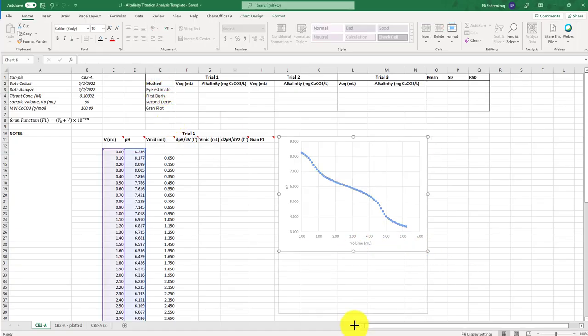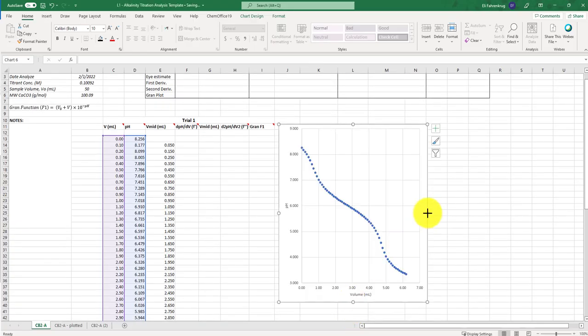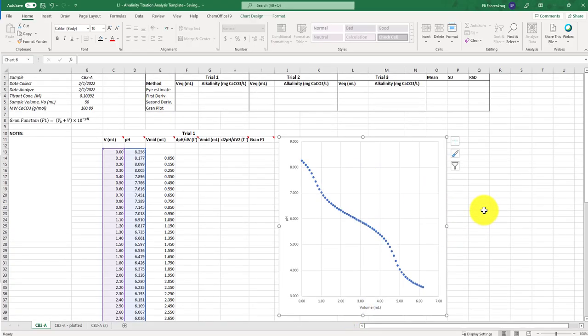To do that really generically and simply, you can just zoom in on your plot. For alkalinity titrations, at least in terms of computing the alkalinity itself, we're mostly interested in the second equivalence volume, because whatever we see as the total titrant added at the second equivalence volume, we can assume there must be 2 equivalents of that in the original amount of carbonate. We'll talk about that more in class. So if I want to eyeball this, I can say, all right, roughly, this is a flat region, this is a flat region, so halfway between there, the closest data point is maybe this one.